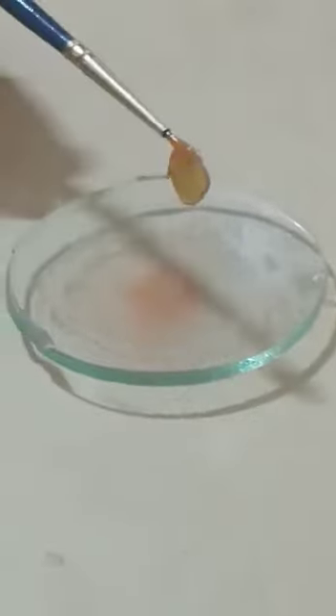After five minutes, transfer this section into another watch glass containing plain water to remove the excess staining solution.